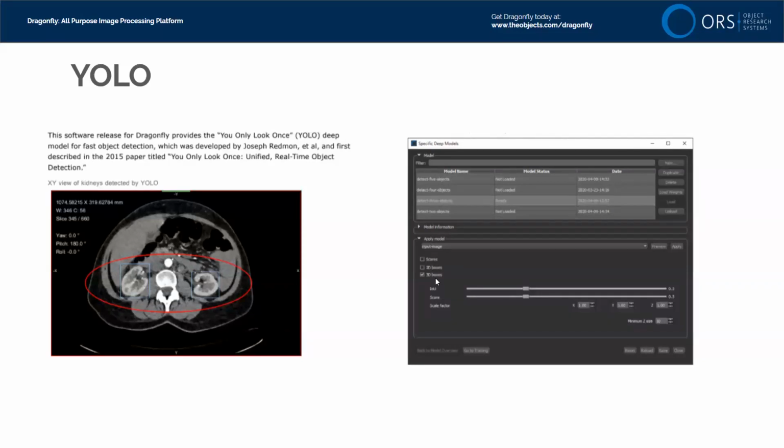So if you're a cryo-EM worker, you may have seen a paper last year on crYOLO, specifically for 2D boxing of particles in cryo-electron micrographs, which are notoriously noisy. So you could use YOLO, or you could implement a crYOLO in Dragonfly so that you could do the boxing there. Now that's a 2D application, but Dragonfly's model also supports 3D boxing.